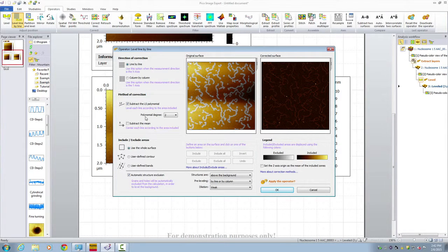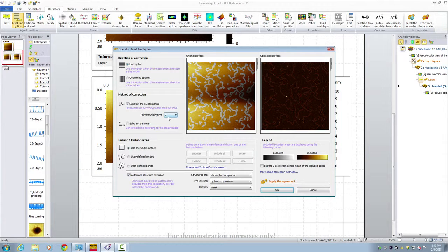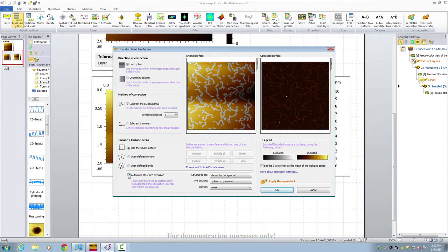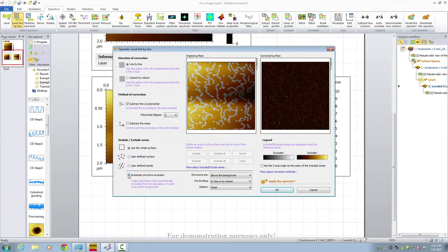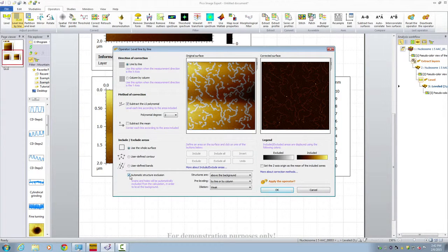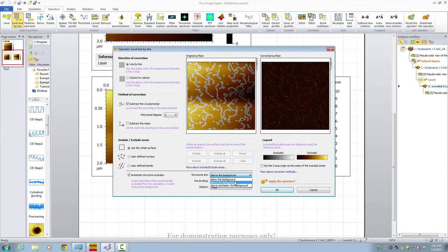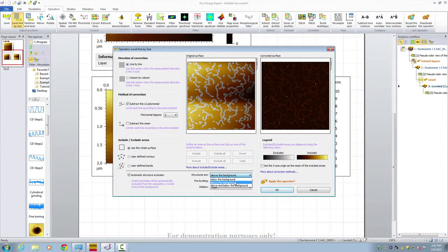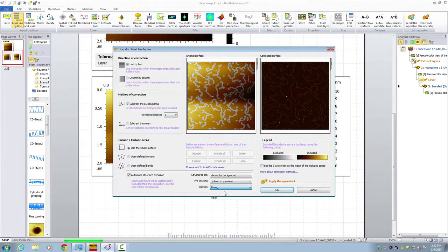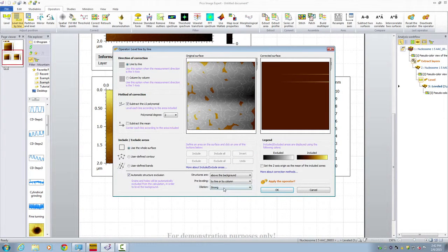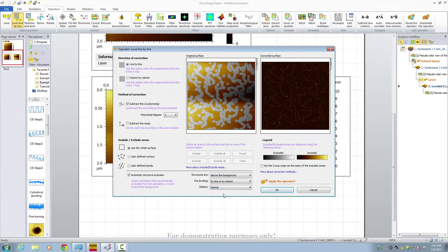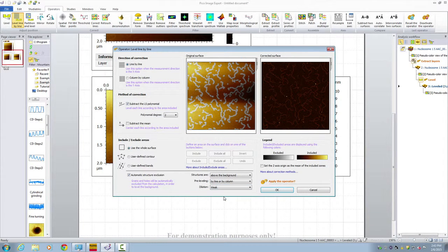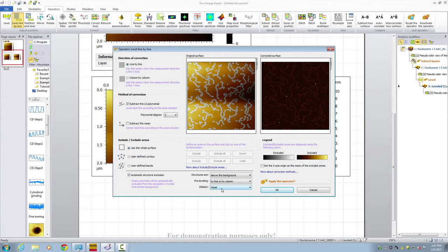Here we choose a second order polynomial degree to correct any bowings. And then we choose the entire area. And then here we choose automatic structure exclusion. This automatic structure exclusion is very important. This will help us to remove any artifact caused by high features. In this case we choose the features above the ground which are those DNA dots and protein dots. And then we can choose either strong exclusion, normal, or weak in this case. These features are relatively small so we choose a weak exclusion. Click OK.